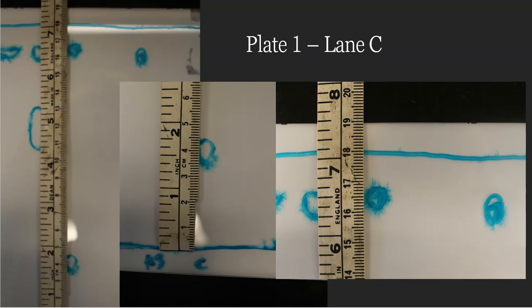Here is plate one for lane C. That stood for caffeine. It also showed up in two spots. One was a little bit lower. One was higher. So what I did is that I focused in on this area. I zoomed in so that way you could see that measurement a little bit better. And then I zoomed in on this area, and that way you can see that measurement a little bit better as well. The mobile phase and that second spot both show up pretty well in that last picture.